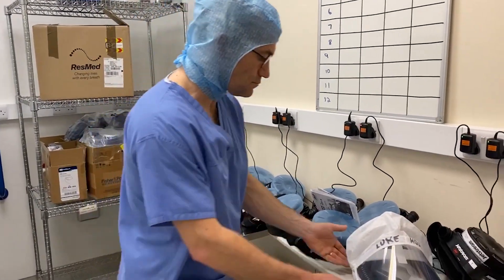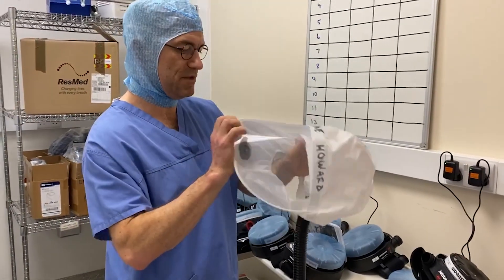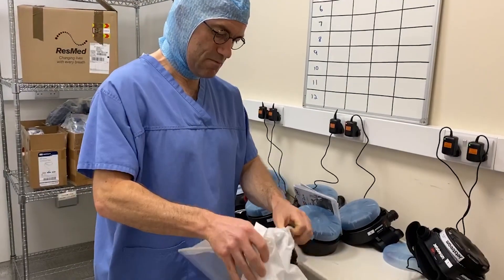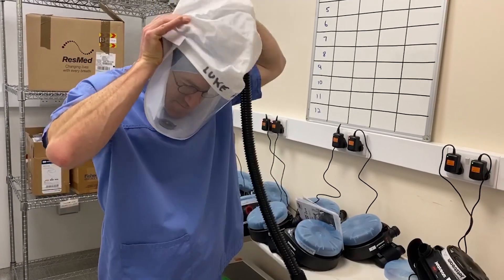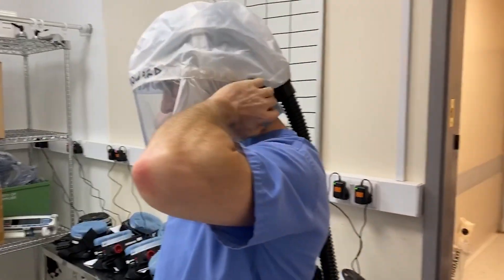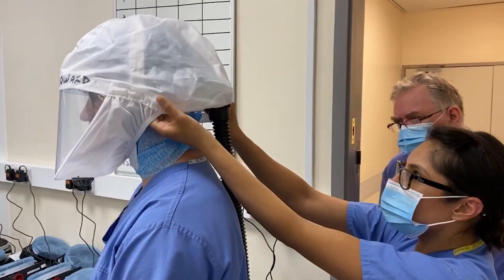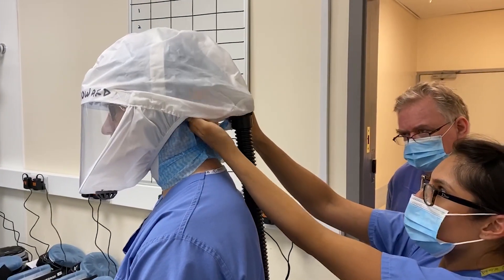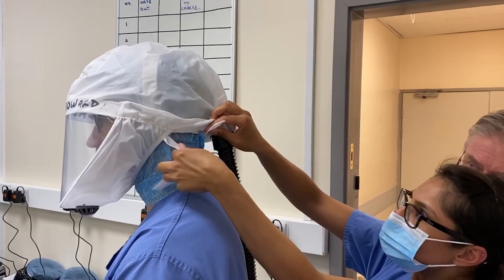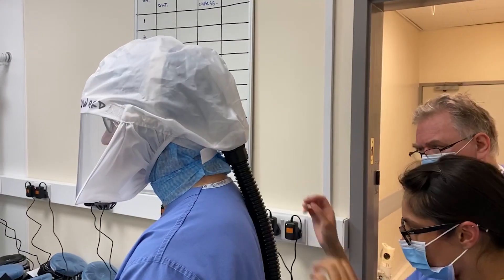Luke, why don't you show us how you're going to put this on? You've chosen not to put goggles on because they might steam up anyway. No additional face mask either, because it's supposed to serve the purpose of the mask at 180 litres a minute — although if you were belt and braced you could put a mask on as well. You need to have a buddy, obviously. So we have an assistant here to tighten this up around the back. There are some ties at the back — it seems to be Velcro. So we've Velcroed the back of your head and it looks secure.